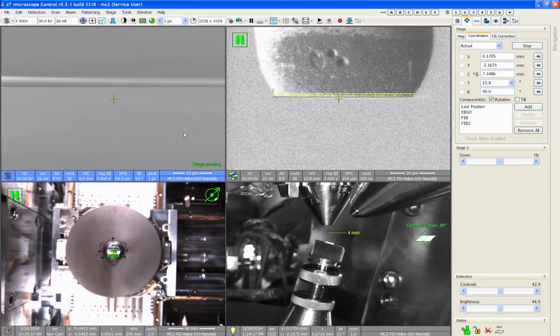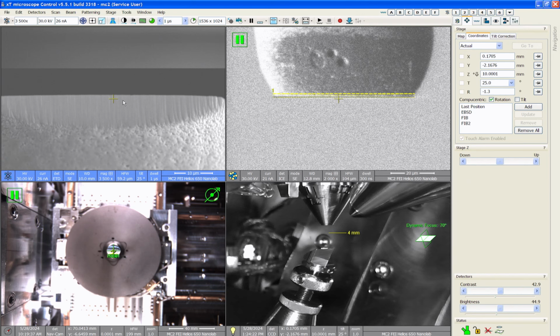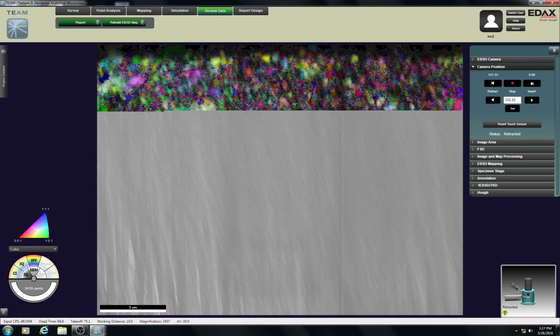So now let's go back to our EBSD spot. Put the camera back in.